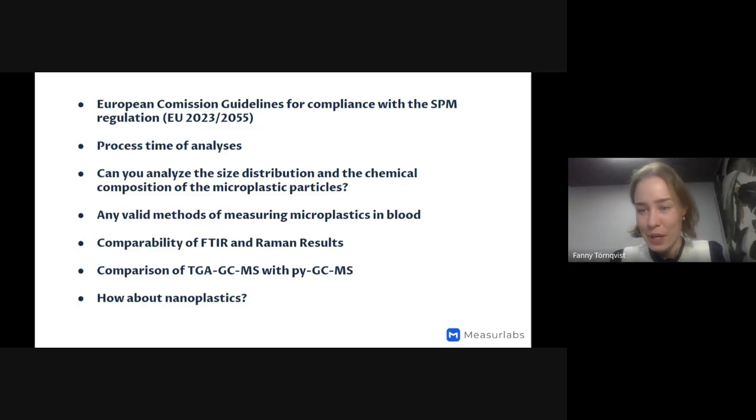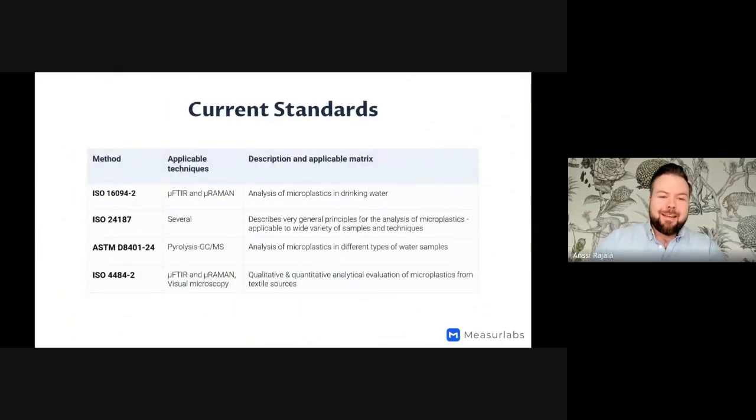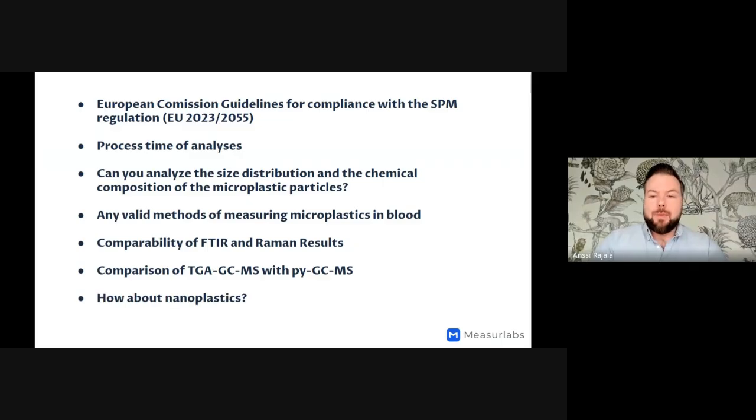Then this might have been answered, but I'll take it anyway. Dora is asking, can the µFTIR and µRaman methods also provide results of mass concentration, regardless of particle size? To some extent, yes, but only in an approximated way. So we can use the ISO, I have to check what the number was exactly, ISO 24187 to approximate the mass results for the particles.